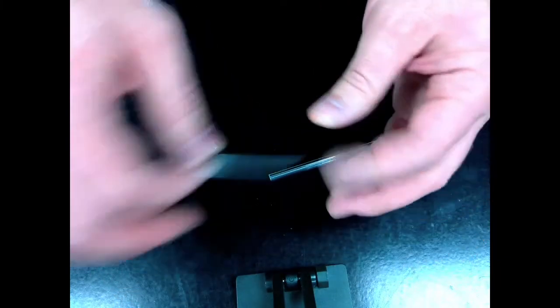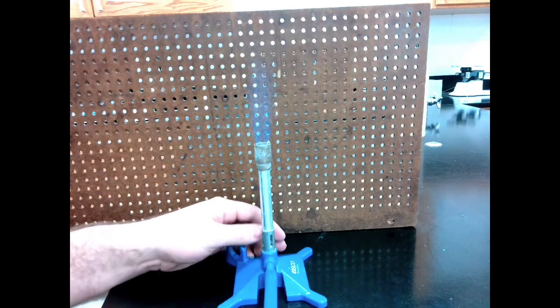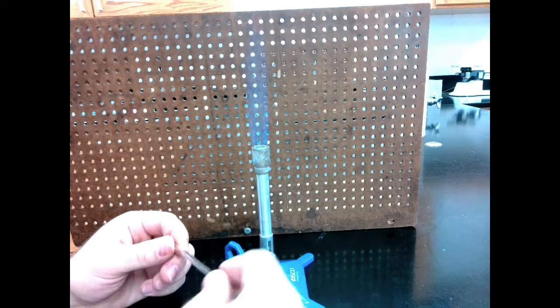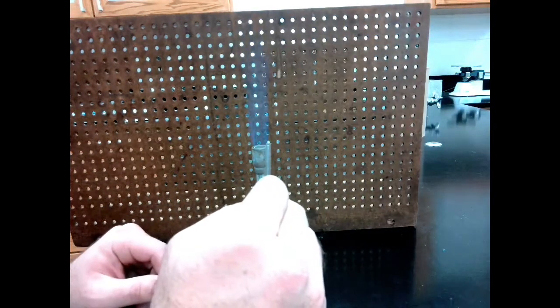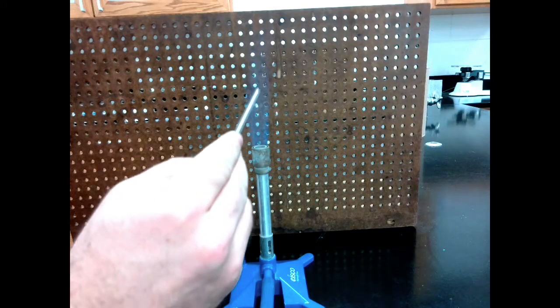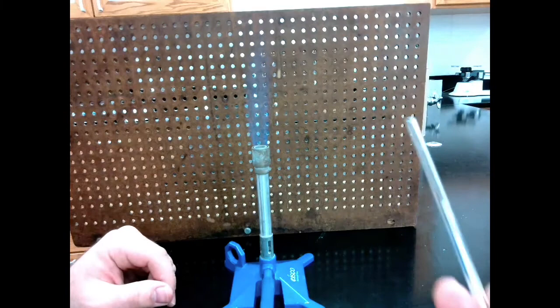First I'm going to cut a longer piece because this is a little too short to bend. Okay, here I have a Bunsen burner ready to go, going nice and strong. I've got my roaring flame. You may not be able to see this in the video, but with that roaring flame, we've got that nice little blue cone right in the middle of the Bunsen burner. Remember, just on the edge of that blue cone is going to be the hottest part of the flame.